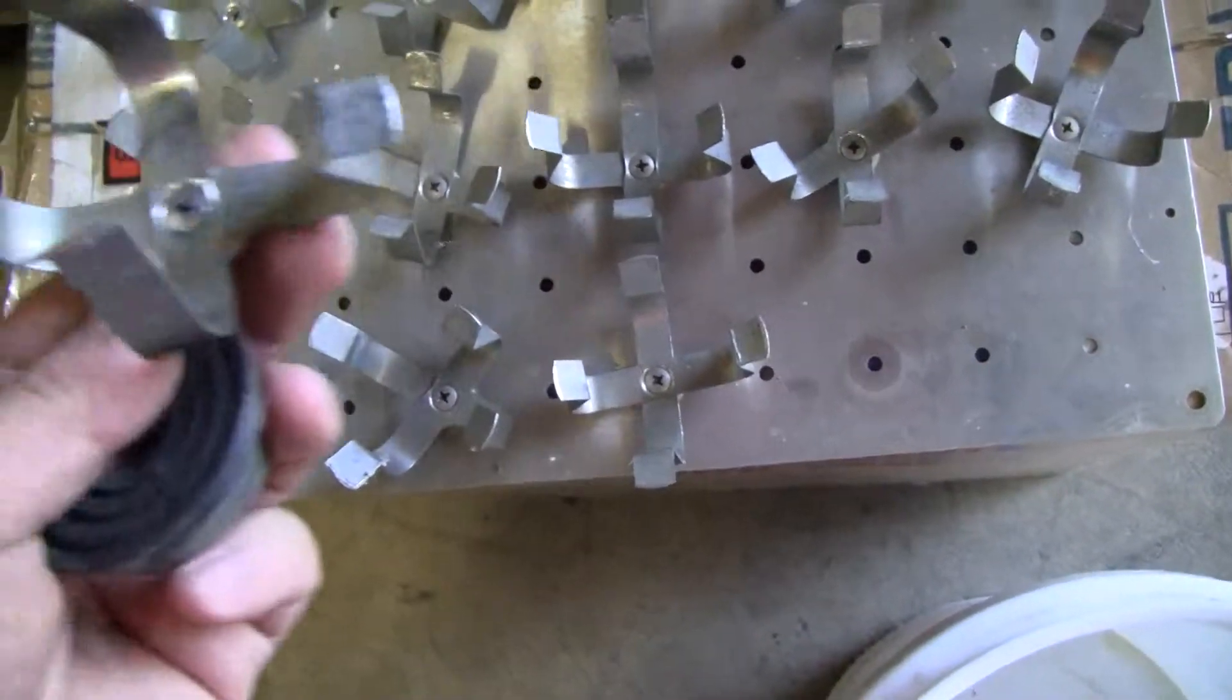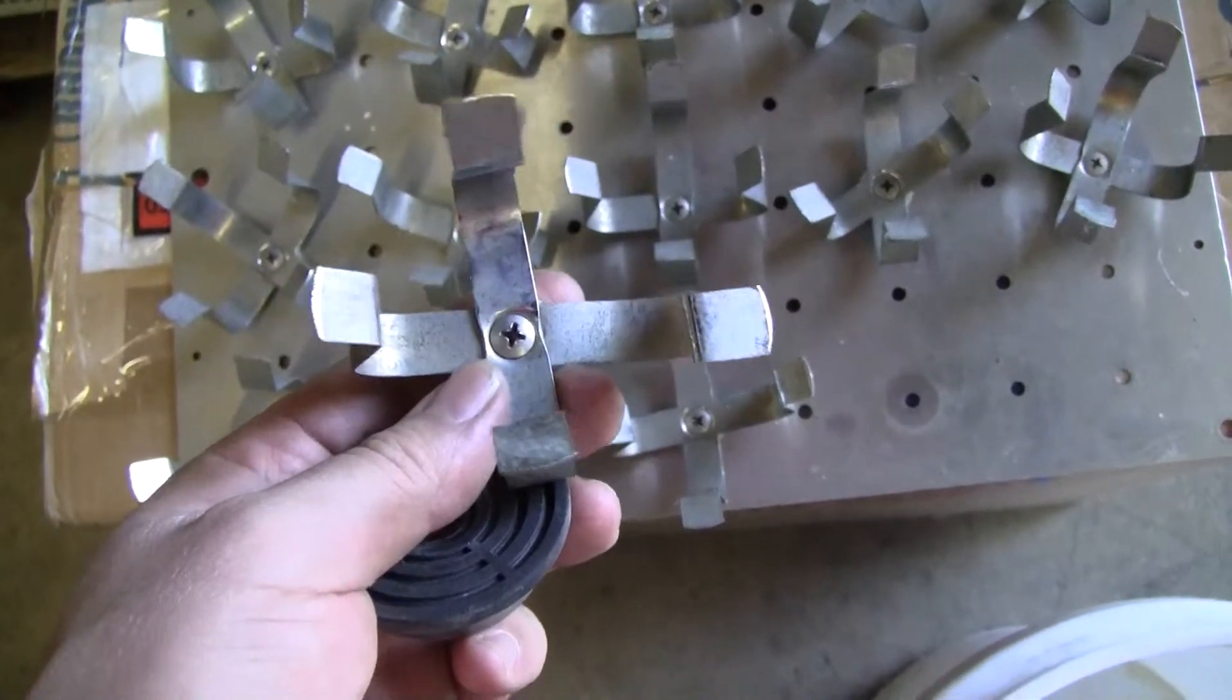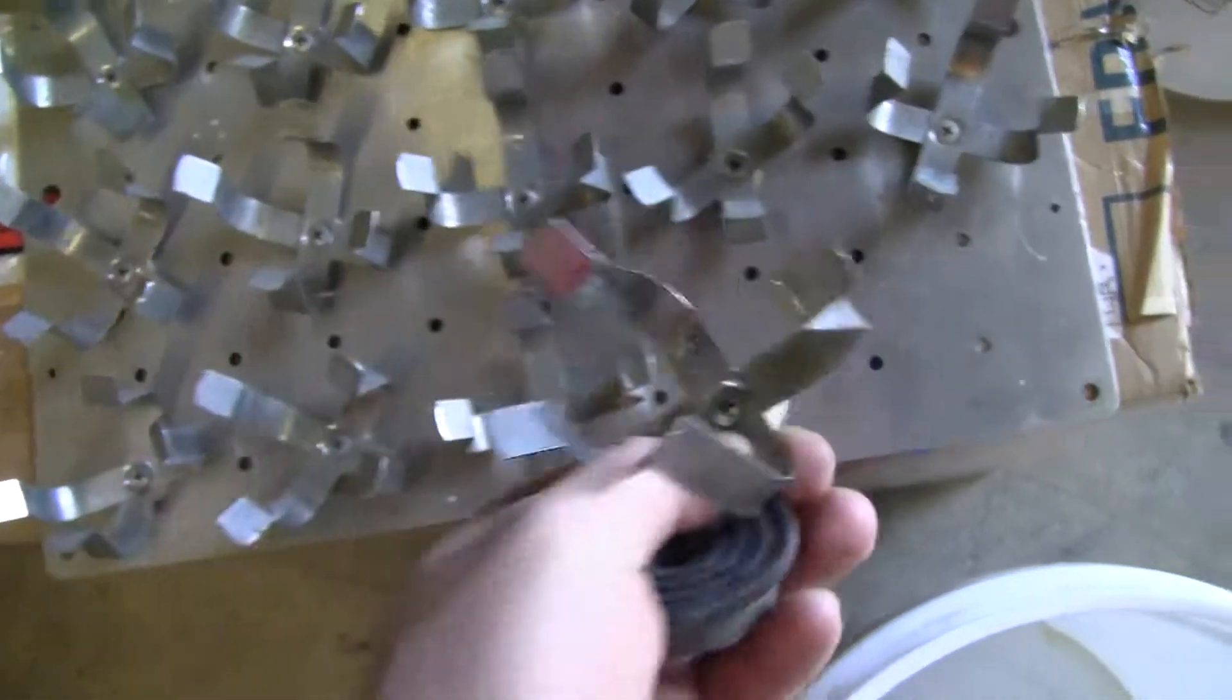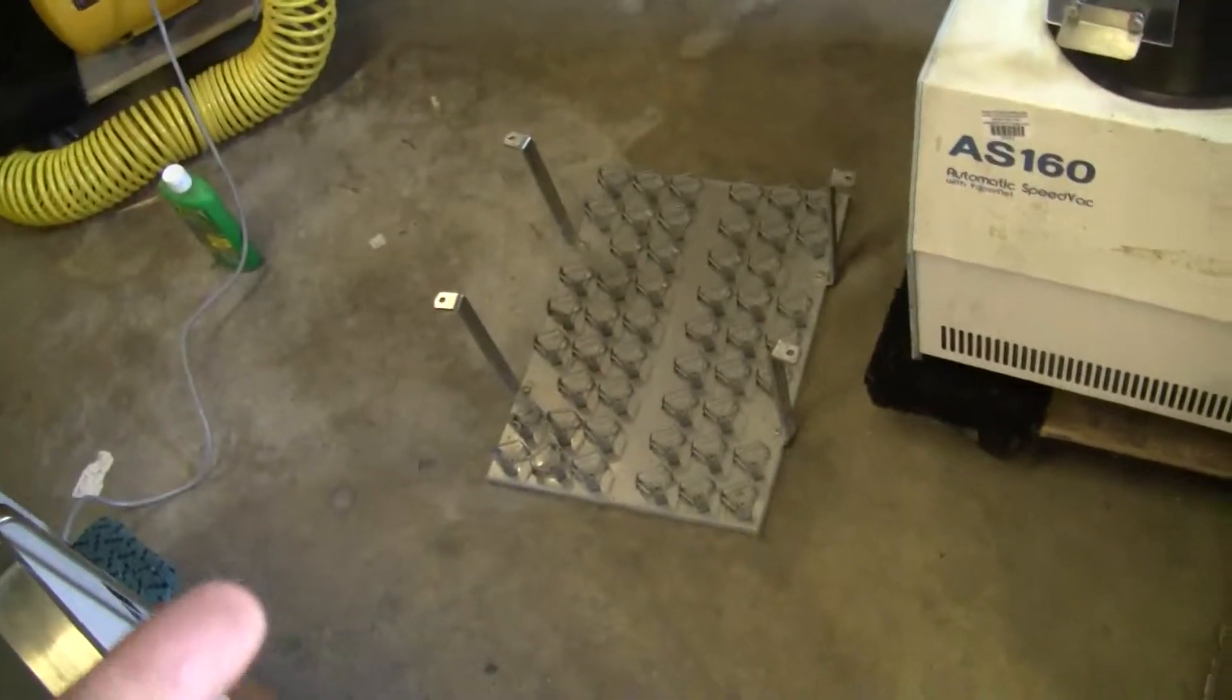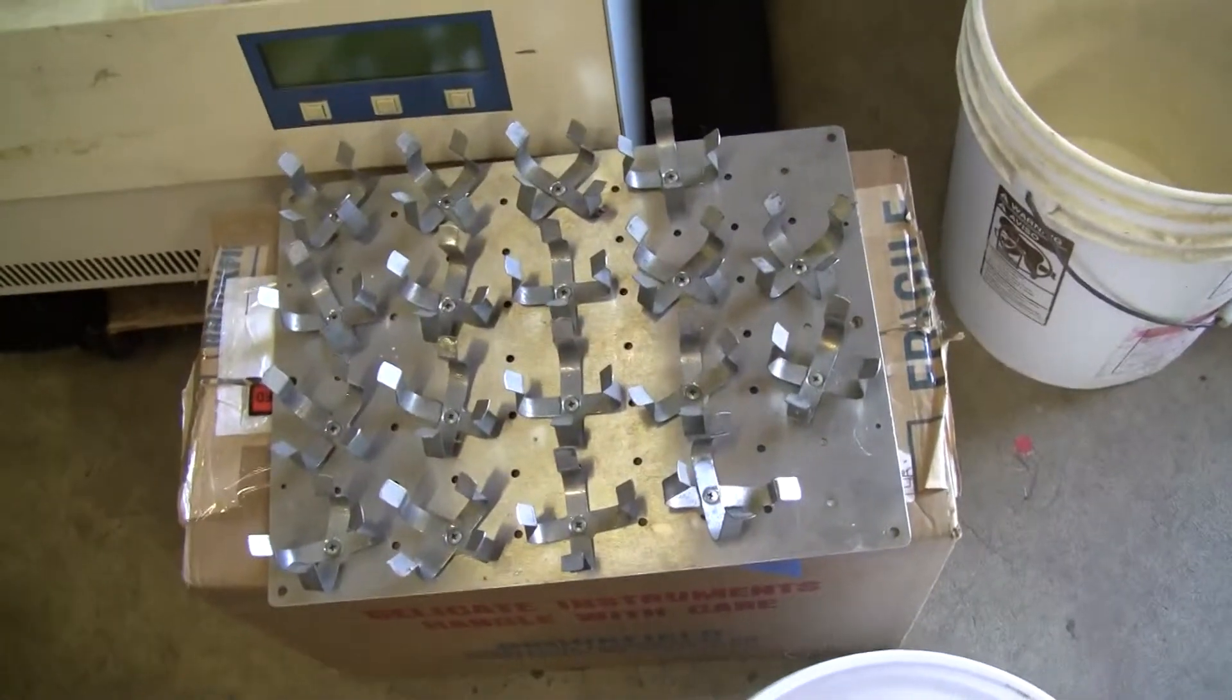The holder is typically just a screw that gets fitted in. You can drill holes in this one, or we can adapt this one.